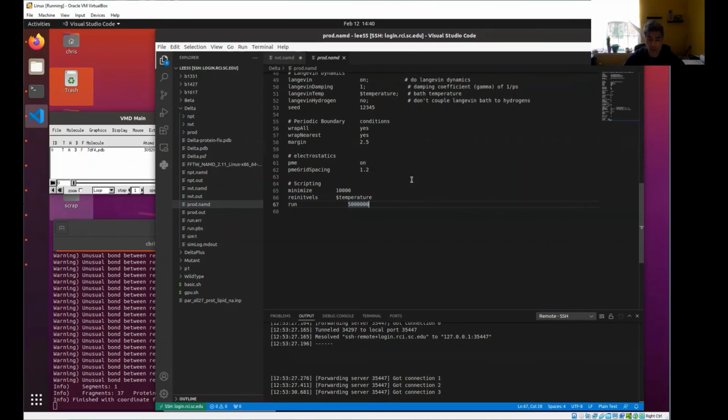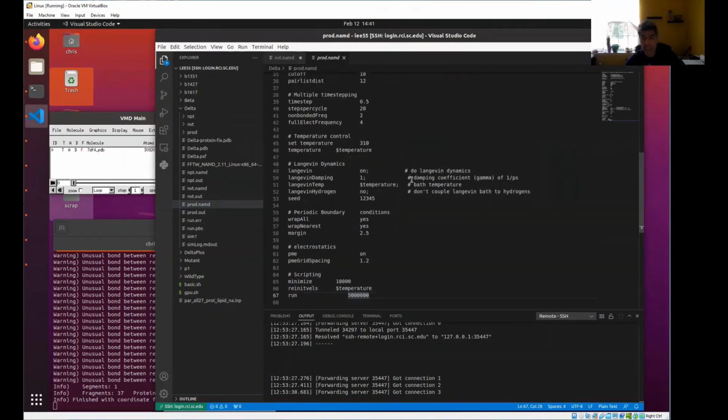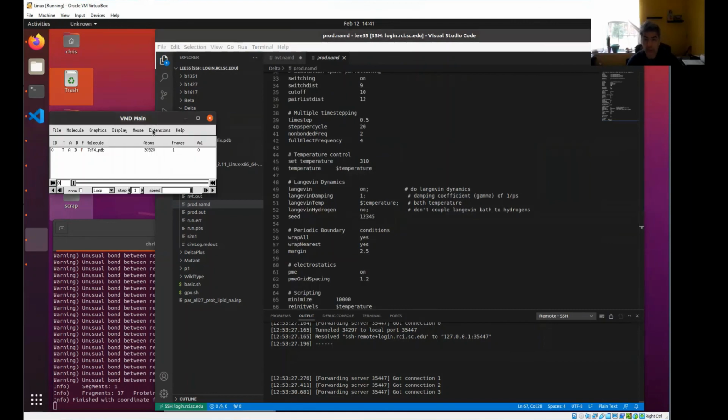So we can stop if there are no questions. You guys can review the video. Yeah, I have one question. I understand you have to use all these interactive windows. Is there any way you can save the syntax, or generate the syntax? You can save it and use that to rerun what you've done before with these two software? Right. So everything about the software, everything here is reproducible, with the exception of one step.